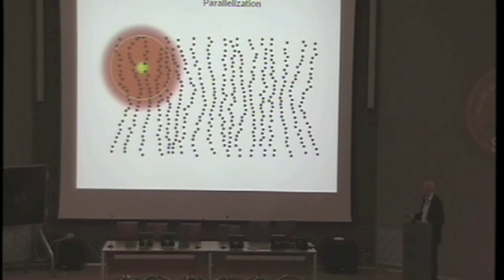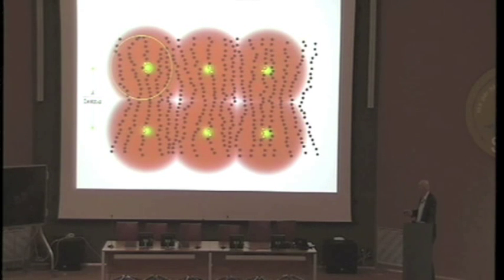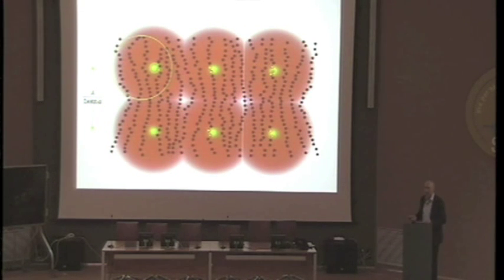We could have another one here, and so on. Because, as I said, each beam here has to do the job only within the 200 nanometer zone. Here we can have another one, and another one, and we can have many detectors at the same time, for example a CCD camera that records the fluorescence coming from here, and so on, at the same time for each scanning step. This way we can parallelize the imaging process and be fast if you want to image large areas.